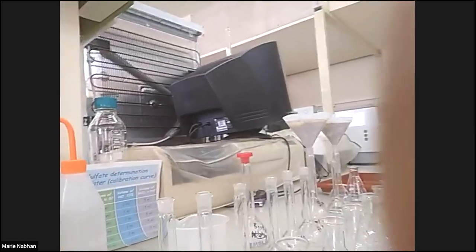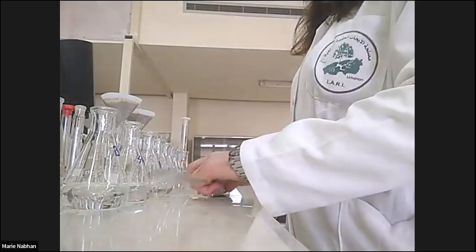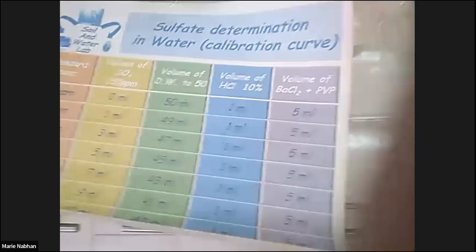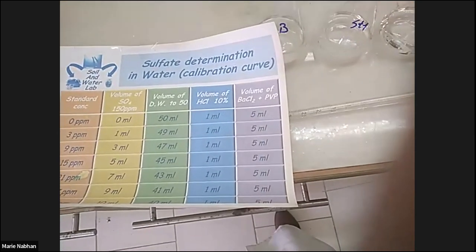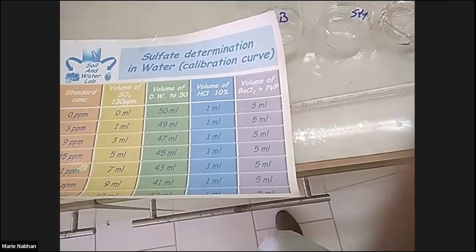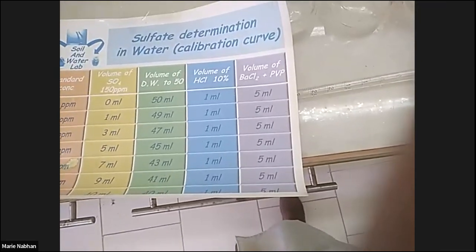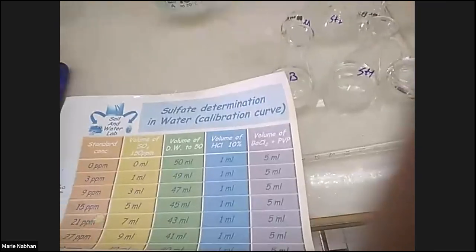I have prepared it as in this table, and I took 1 milliliter for the first one, 3, 5, 7, 9, and 10.